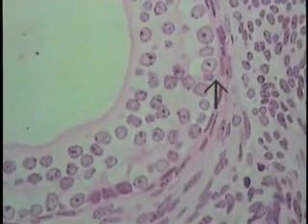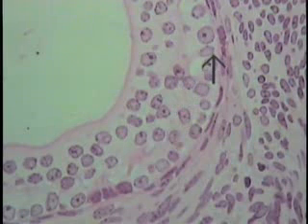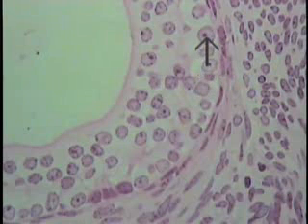This band of structures here, as indicated by the pointer once again, is a collection of several cells. Nonetheless, the nuclei can be made out quite clearly, as well as on occasion the nucleolus, as shown here, or perhaps here and here. Find a field similar to this one and examine it in detail. At increased magnification, several features can be illustrated. Once again, identify the nucleus, the boundary of the cytoplasm, which is approximately here, and nucleoli if they are present.